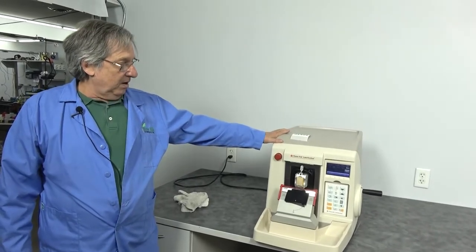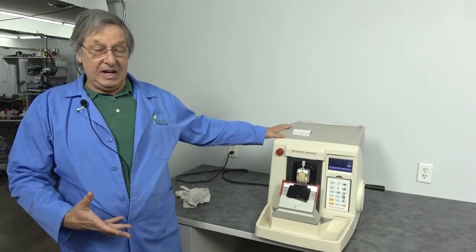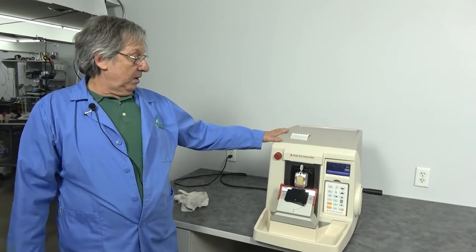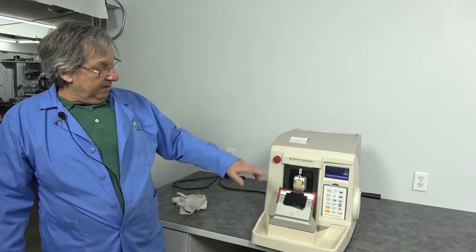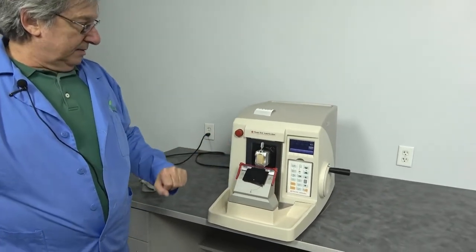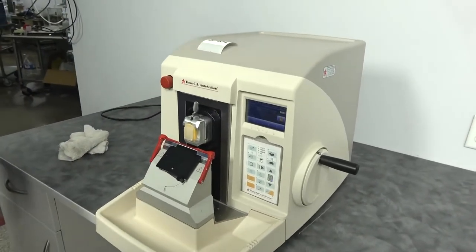A very advanced unit, one of the most incredible personal microtomes that we've seen, made for production level sectioning. Very automatic, as I said. Unbelievable amount of features. Manual is rather extensive. It's got a lot of features.